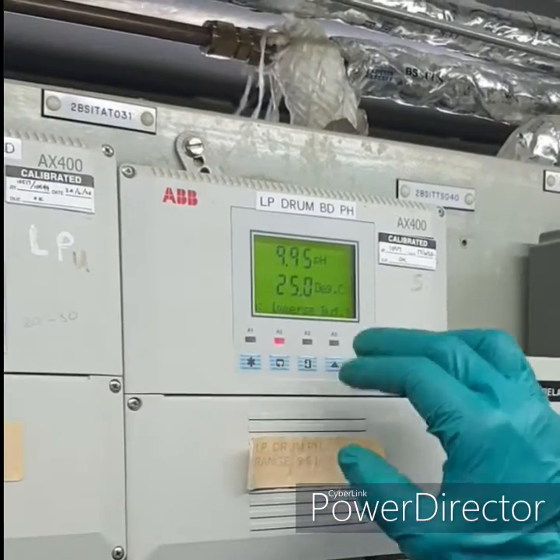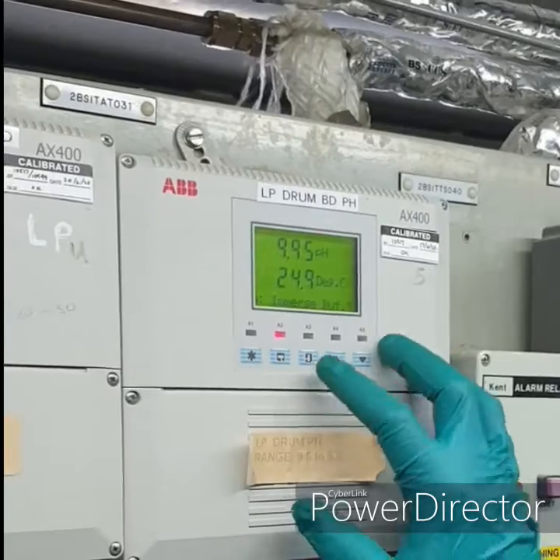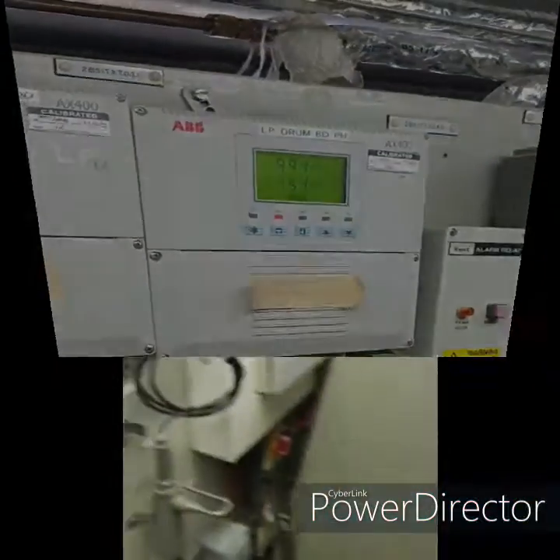The analyzer is asking to immerse the sensor in buffer 1. Our buffer 1 is 10 pH. Enter. Now it has started.